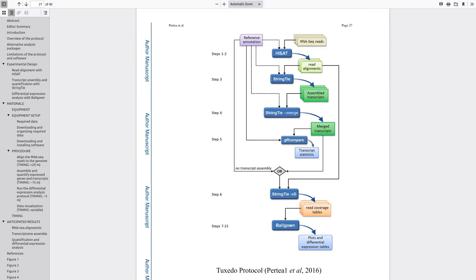For this tutorial, we are going to use this workflow which has been displayed, and I will leave the link to the paper so that you can read more about this workflow as well. If you are a beginner, I will also encourage you to watch my other video where I give a general overview of RNA-seq data analysis, so please do that.